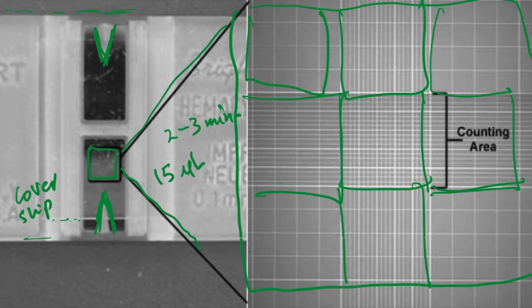The rules vary from lab to lab, and the standards also vary, but let me define certain parameters for our case. One of the rules could simply be about a cell. Let me draw the cells first and then we will go over these rules. So I'm going to draw some cells first, in white.